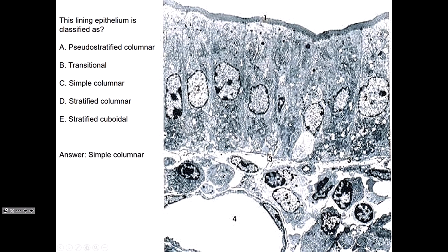It's not pseudostratified because it's not epididymis and it's not respiratory epithelium. Respiratory epithelium is going to have true cilia, very long. Epididymis would have sperm out here. Okay, these are microvilli, the brush border, and really the nuclei are pretty much arranged in one plane. I'm not seeing any basal cells down here, which you will see in pseudostratified. Okay, it's pretty much a uniform layer of nuclei in the same plane. So it is really simple.